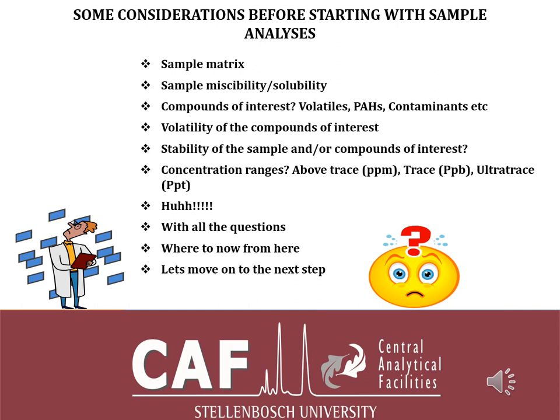And also, one other thing that's important is the concentration range that you're working with. Are you working with milligram per liter, which is ppm? I call it above trace. You can call it something else. Or are you working with trace analysis, which for me is ppb, between 1 ppb and 1,000 ppb? That's trace for me.